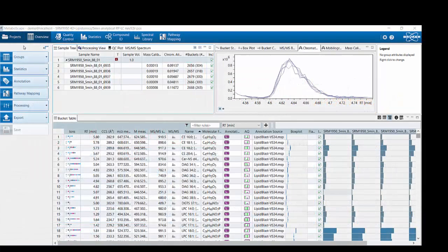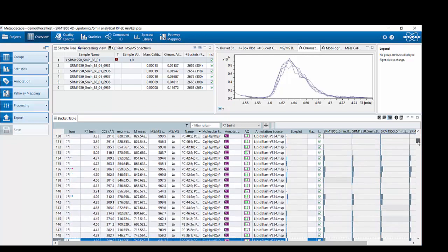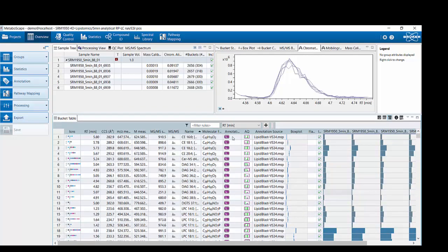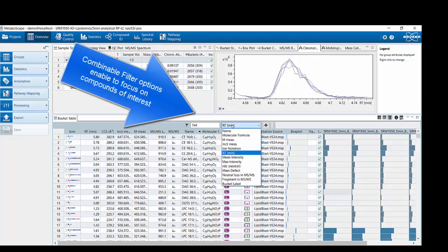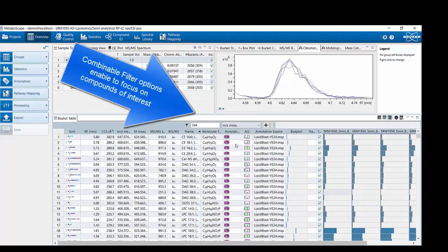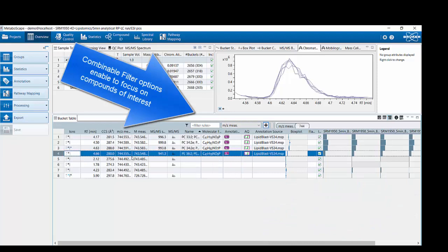Here you can see the MetaboScape overview perspective with five replicates of SRM 1950 separated using a five-minute reversed phase gradient and acquisition in PASEF mode. Down here is the so-called bucket table with all the T-Rex 4D extracted features. If we scroll down you can see that a lot of lipid classes were annotated, and MetaboScape enables different filtering options — for example, filtering by measured mass of the precursor. Applying this filter greatly reduces the list.